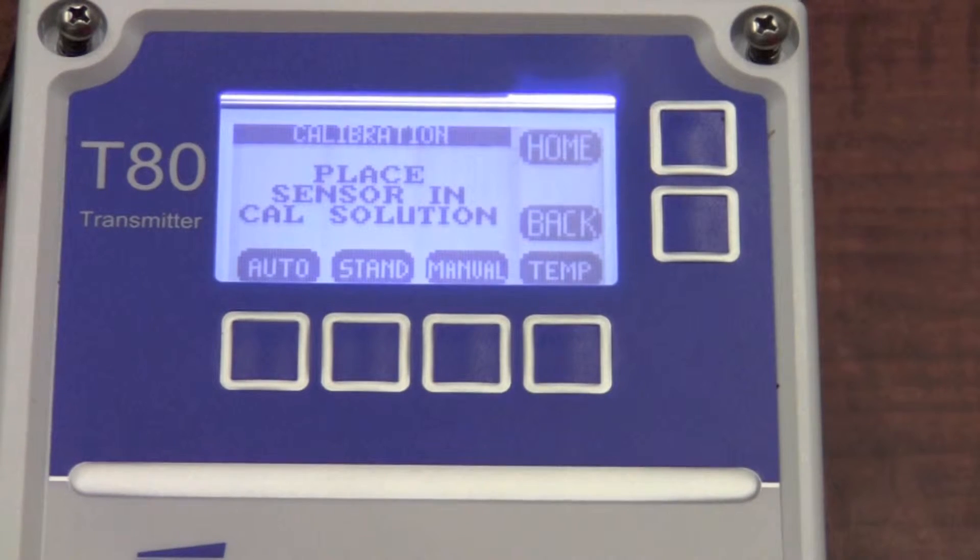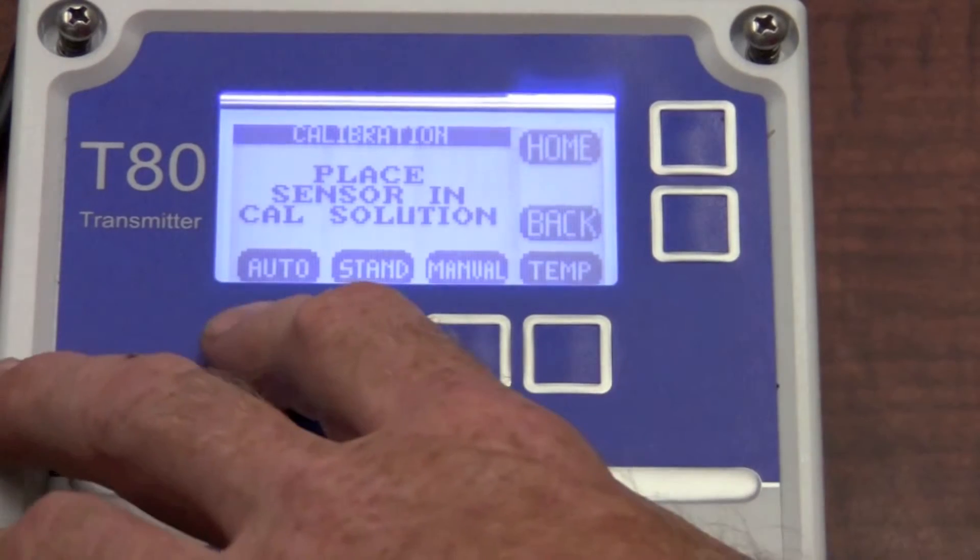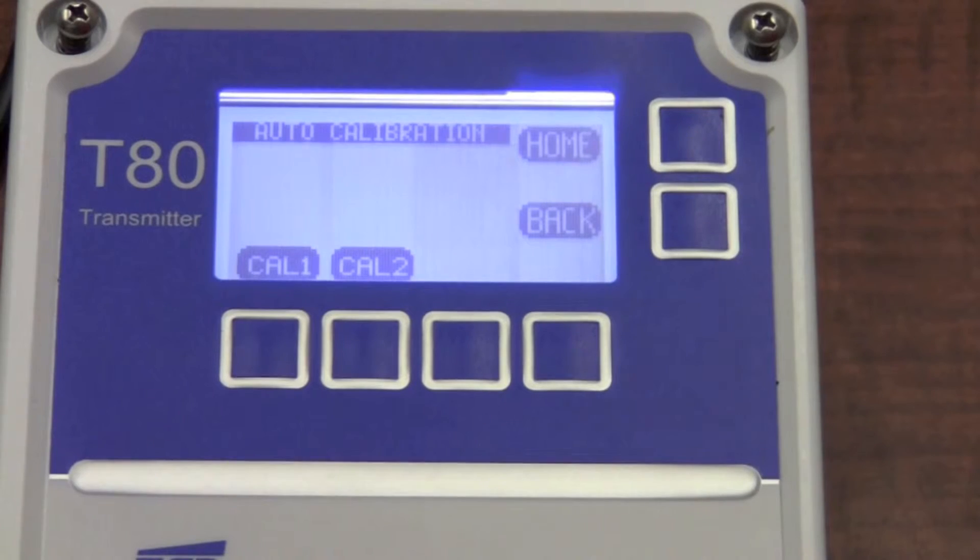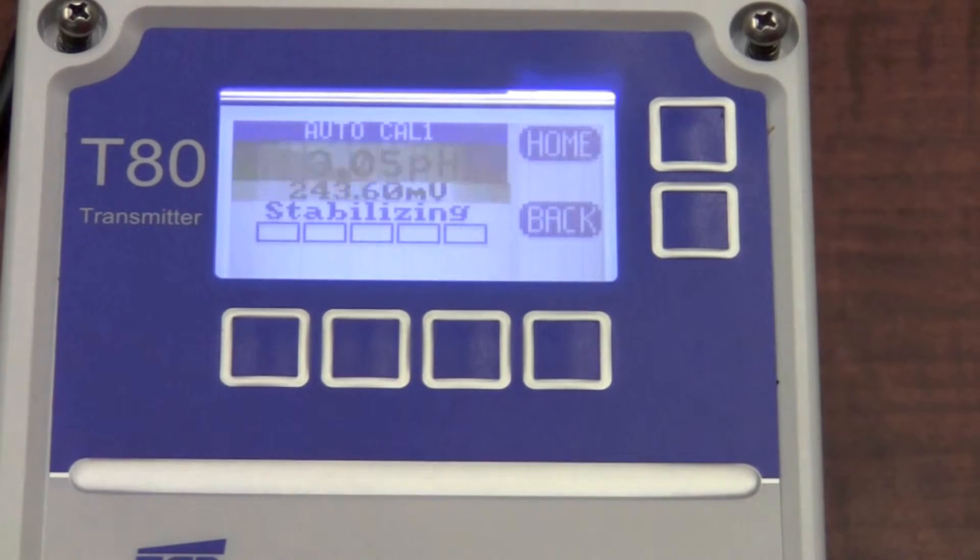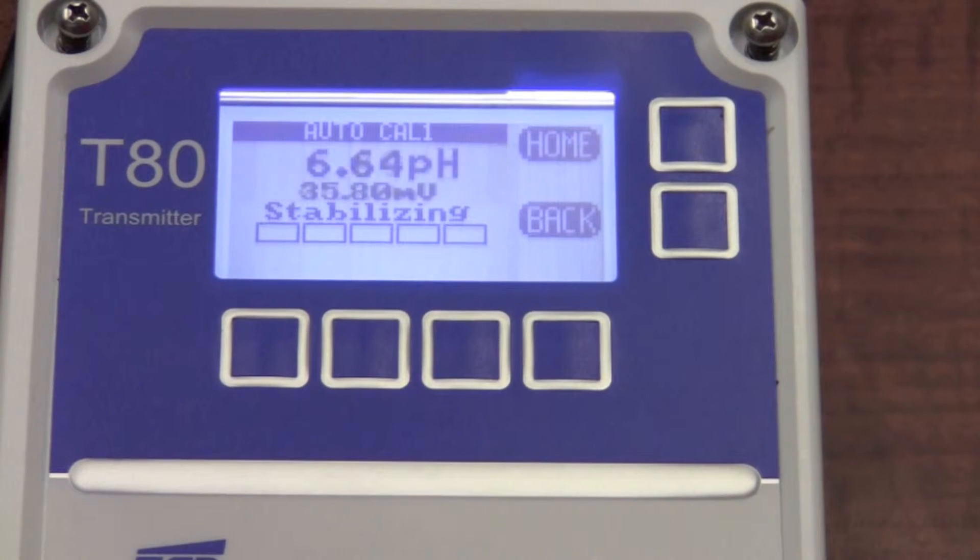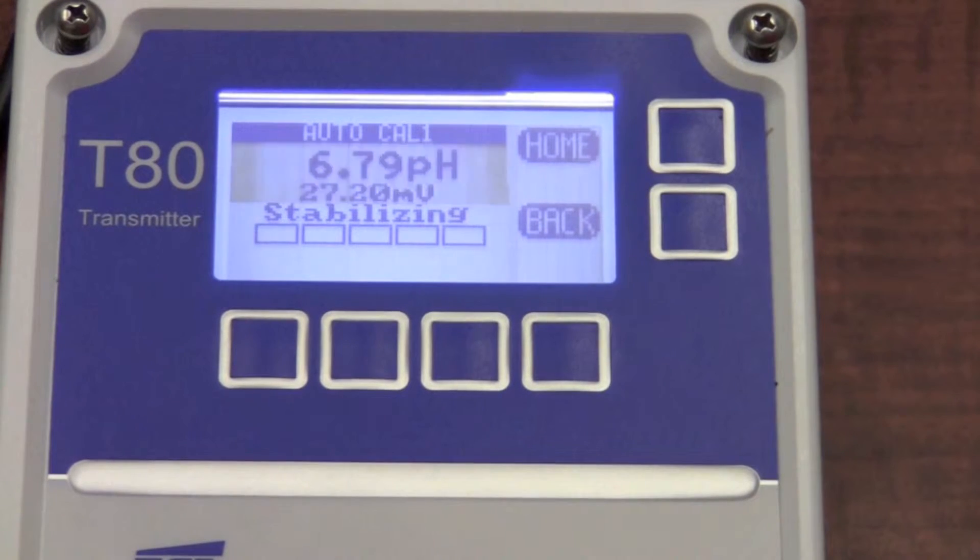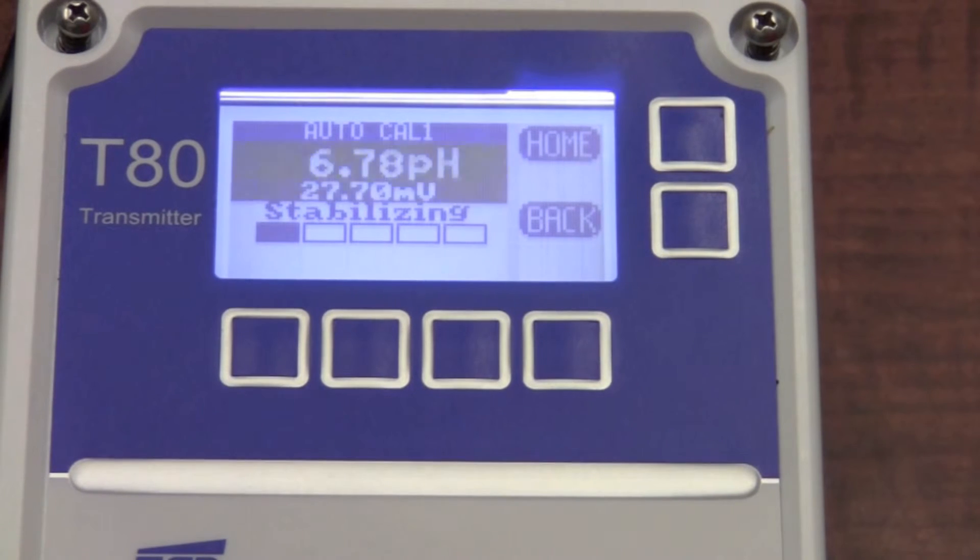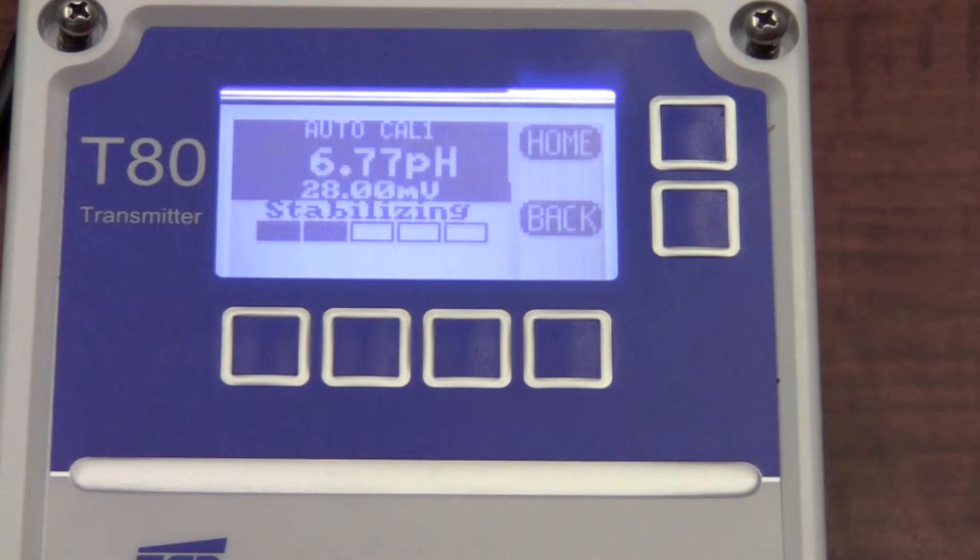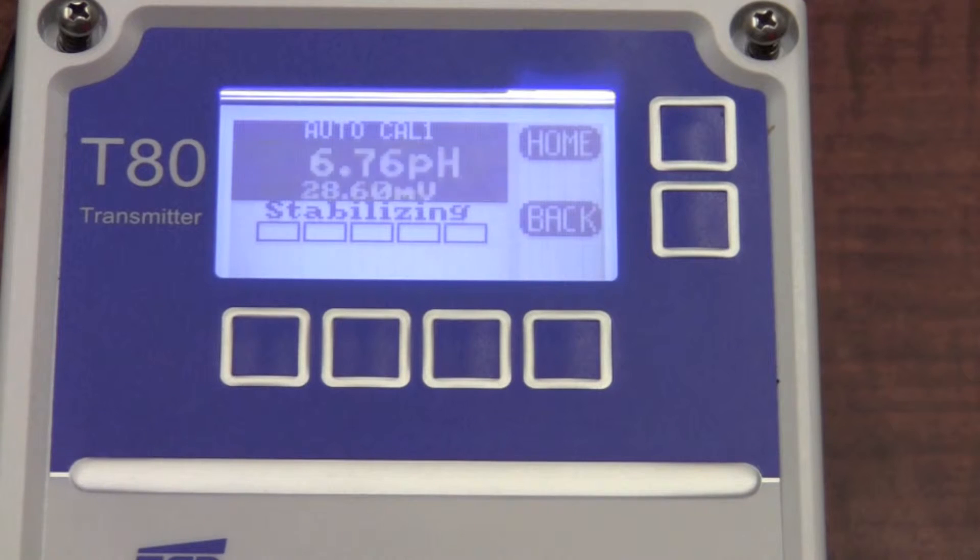The T80 simply asked me to place the sensor in one of my calibration solutions. I'm placing that in seven buffer. As you can see, the T80 starts to interrogate the transmitter, reading the millivolt value coming off of the pH electrode. It's going to wait for stabilization, and once it's satisfied that it is stable, the T80 thinks it's as close to one of the standard calibration solutions of seven.